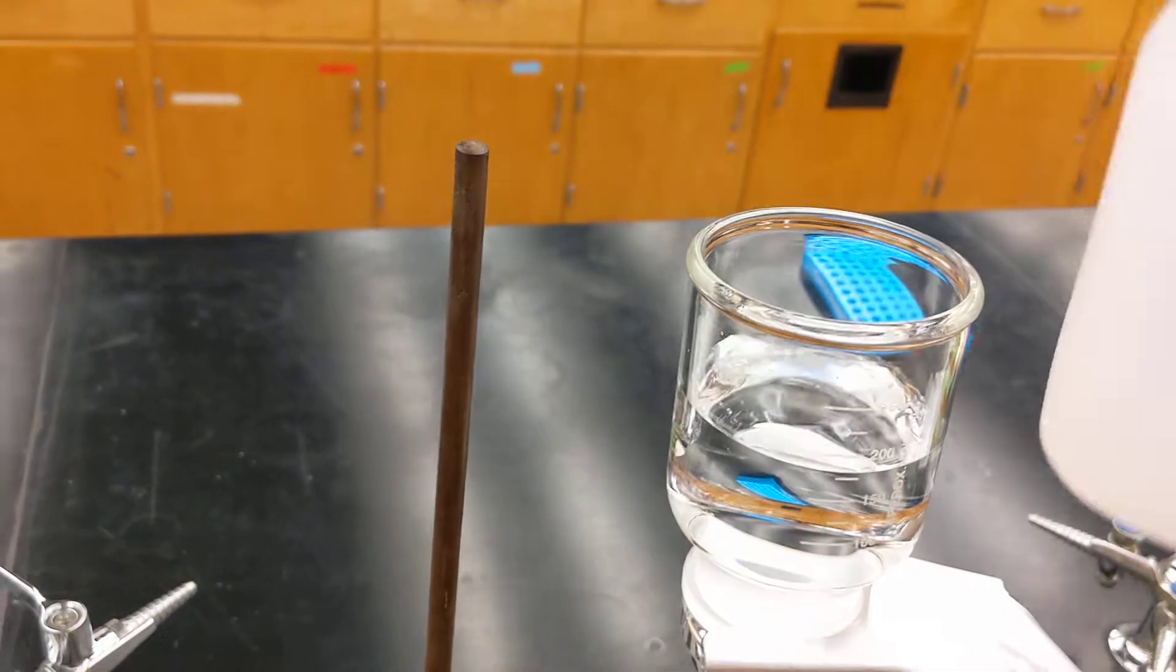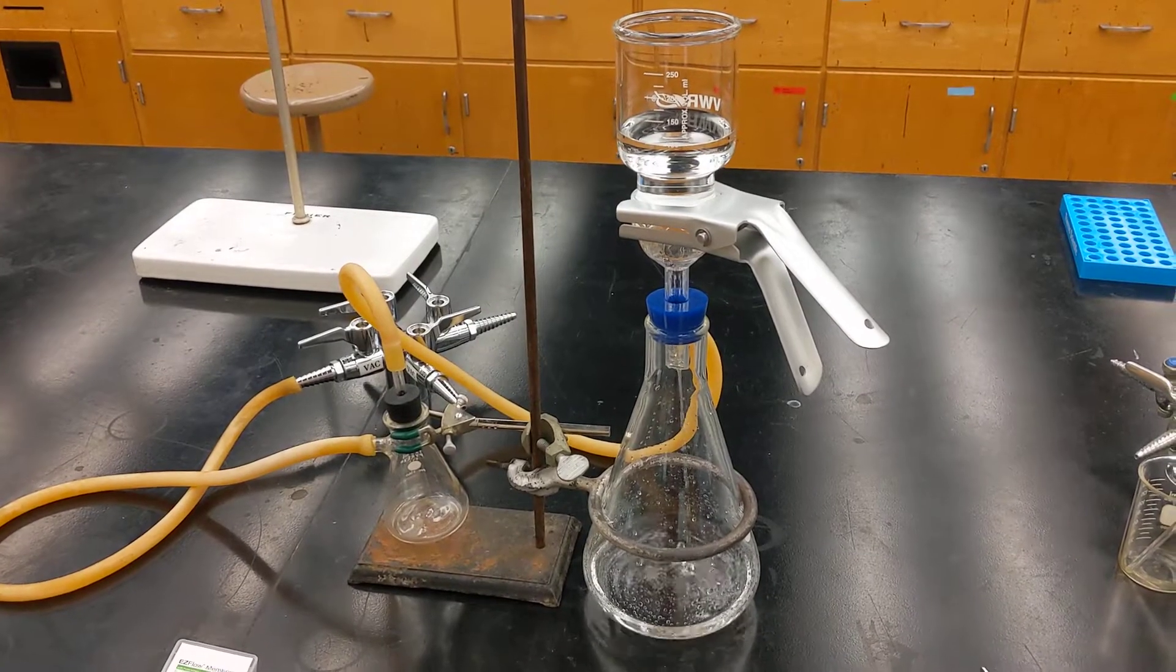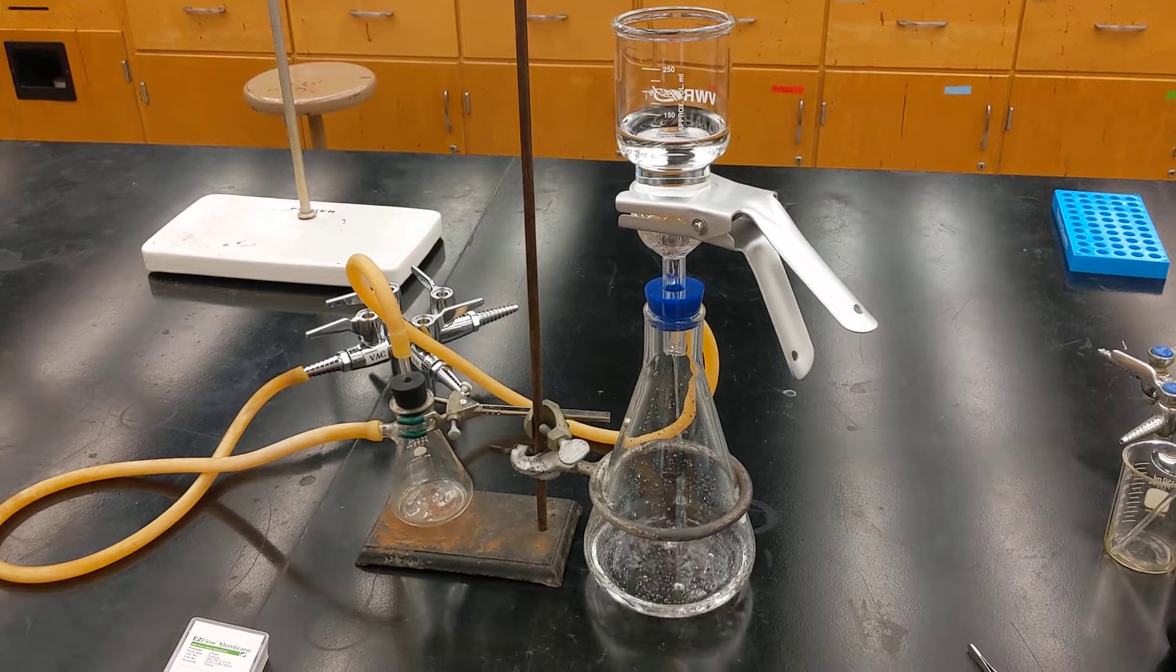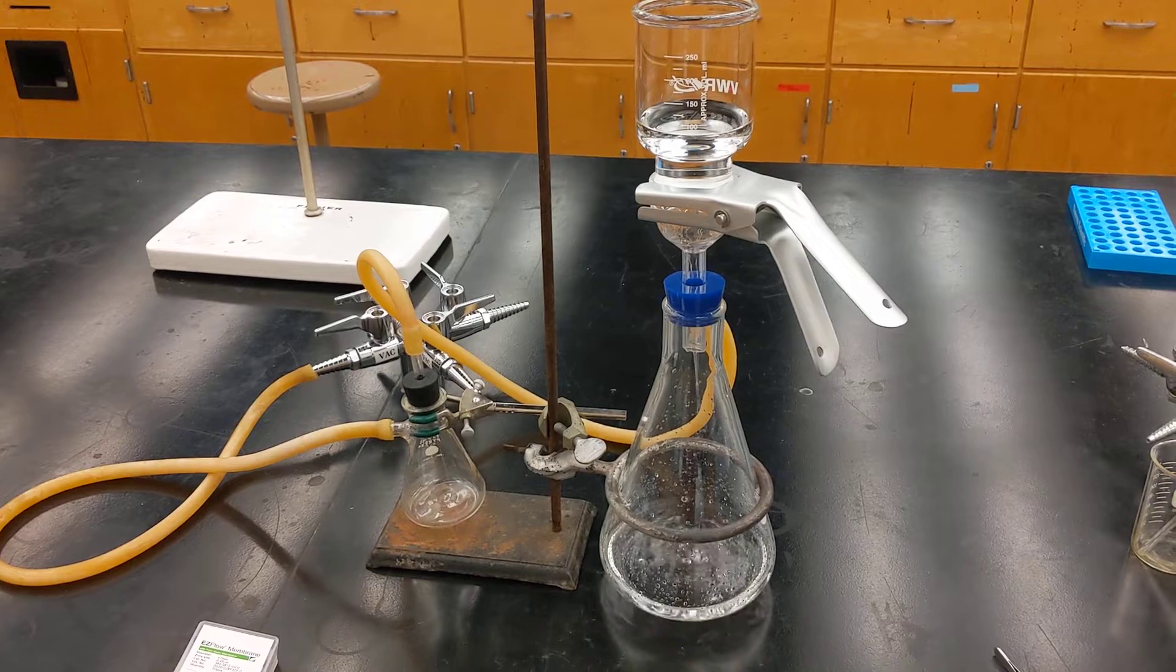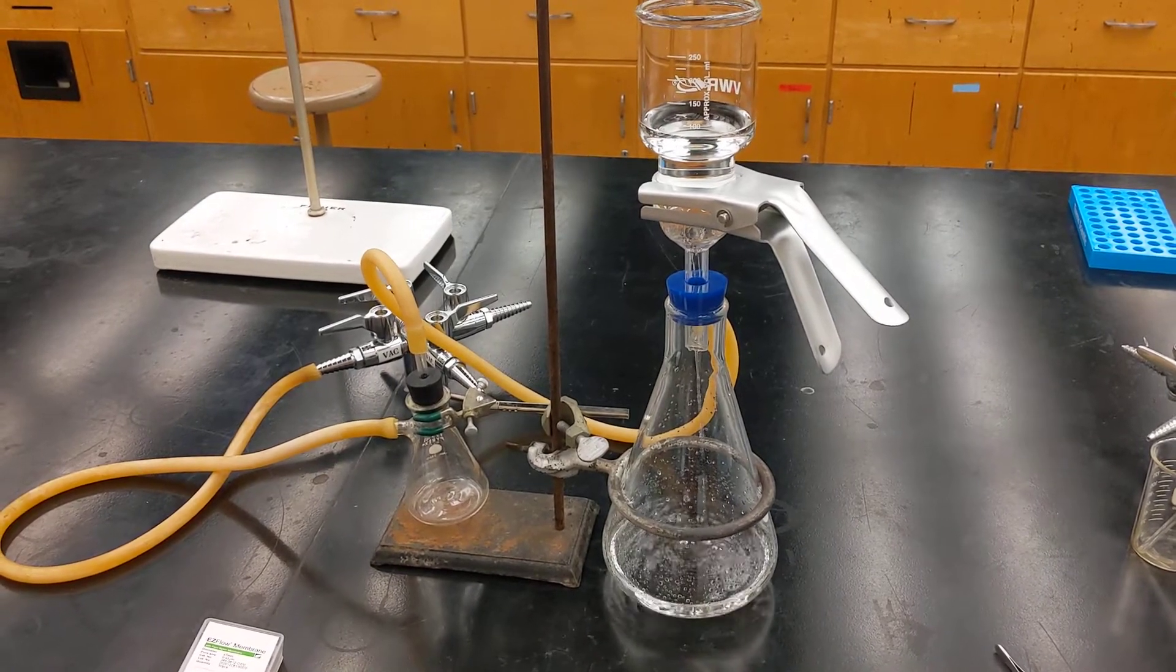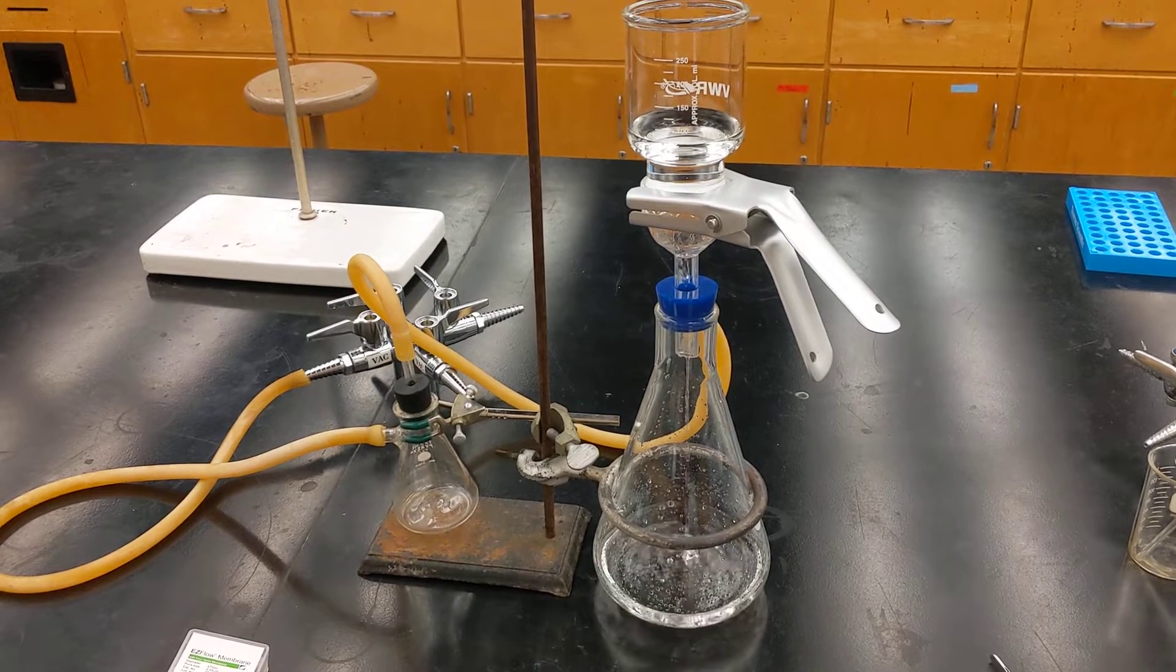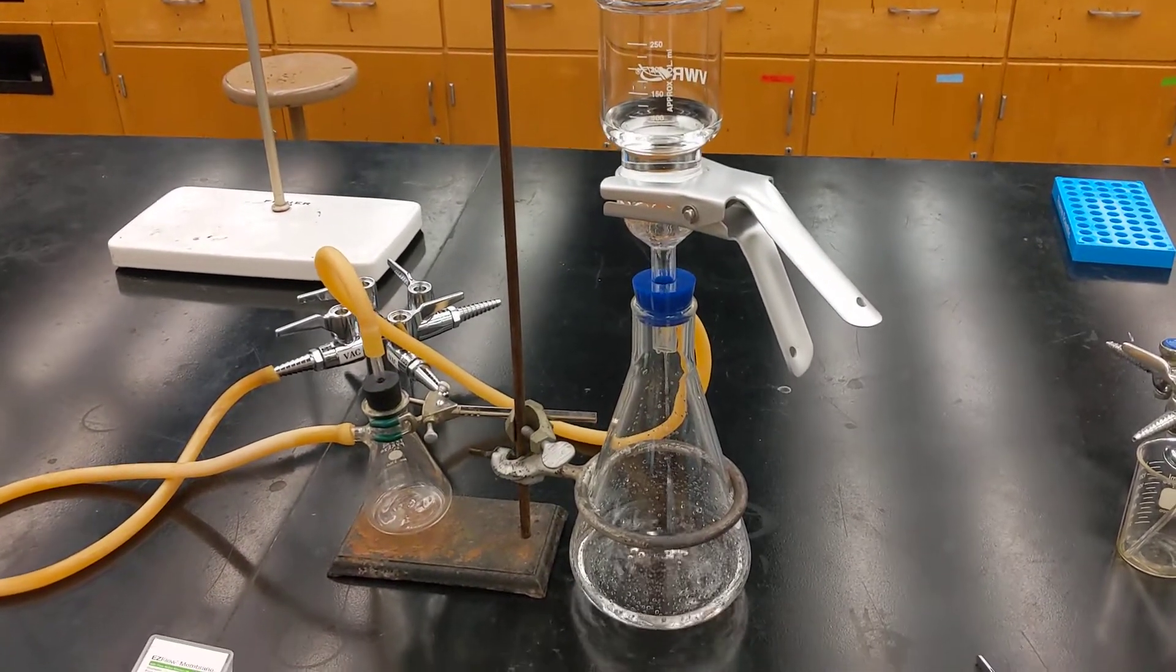Here's the setup about a minute later. You can still see it flowing nicely. It gives you a sense for the time. If you have a pretty turbid, dirty sample, it may be helpful to do a syringe filter first just to get some of that larger stuff out before you do the 0.45 vacuum filter. Otherwise it can take too long.